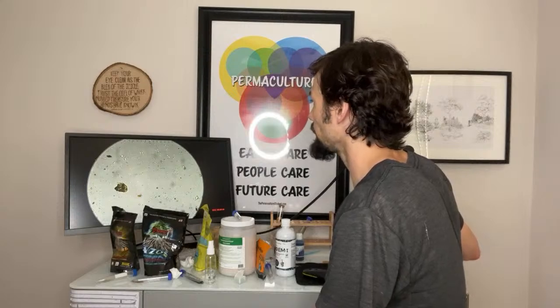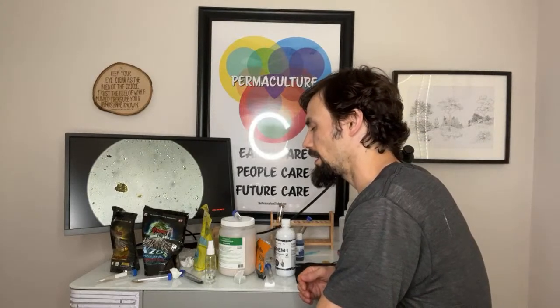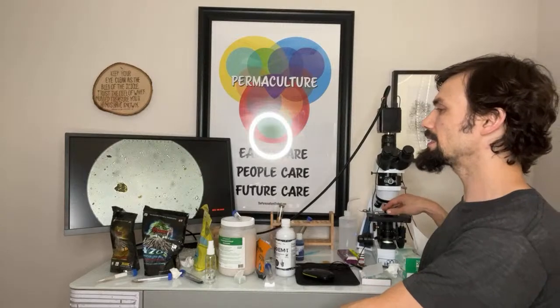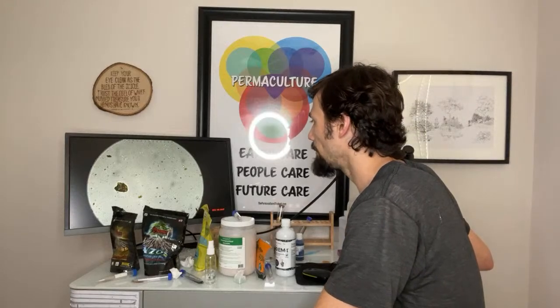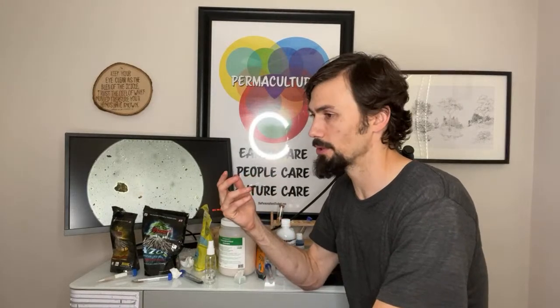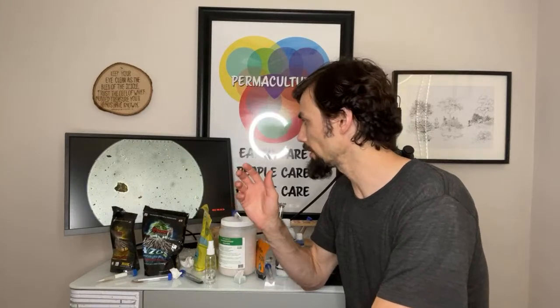Because there's a green and purple cast to the achromatic, I think it's achromatic, right? I can't remember. But these lenses, the way they're optically constructed, you really have to go in and out to map what their actual color is when you're doing this. Because they're clear, these microbes are almost always clear because they have to let light pass through them. And that's how they absorb energy too. They refract light. They create like little green and purple rainbows on the edges.